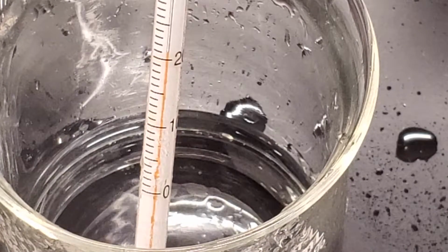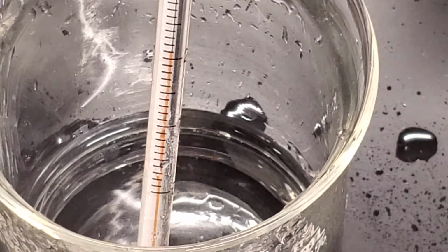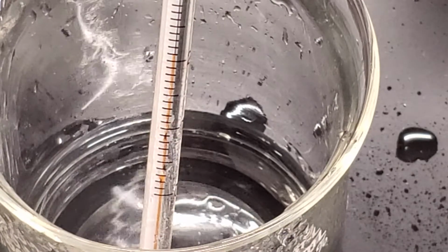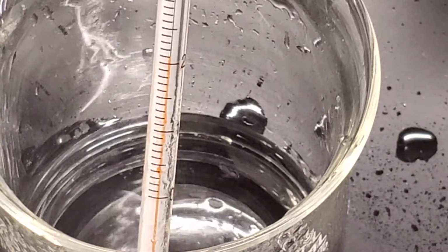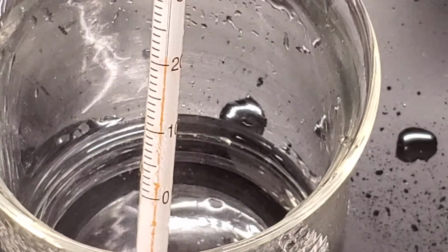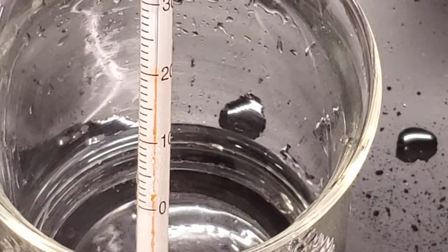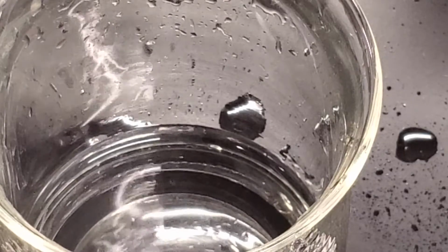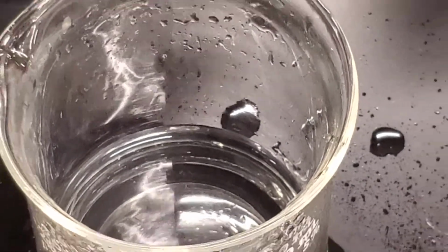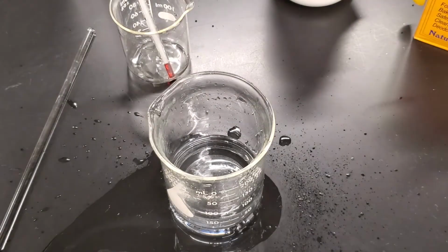And as we're finishing out these last few seconds, again, the 20-degree line is that longer line, and it looks like it's pretty much going to stay in that same location with that 1 hash mark above. So make sure that you record this temperature next to the water and calcium chloride on table 2 for starting temperature. So we'll move that out of the way. This time we will be taking the calcium chloride and measuring out 5 grams of it, stirring it around.